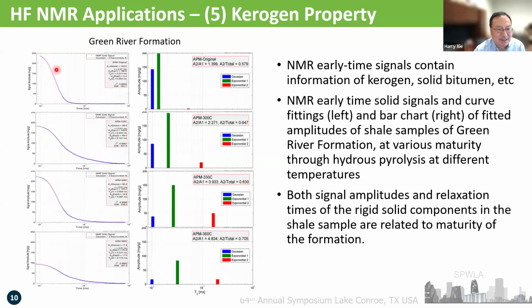During the ring-down time, no meaningful data can be acquired, so we have to wait. The wait time for 2 megahertz is normally from 30 to 50, even 70 or 80 microseconds. You can make it a little bit shorter, but still in the 20 or 30 microsecond range.